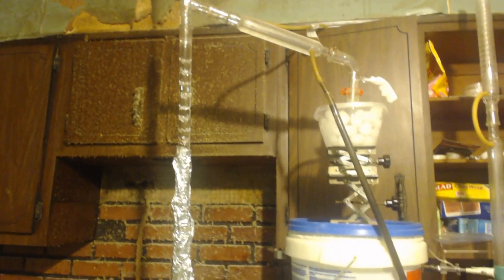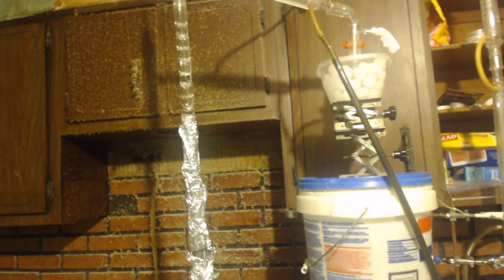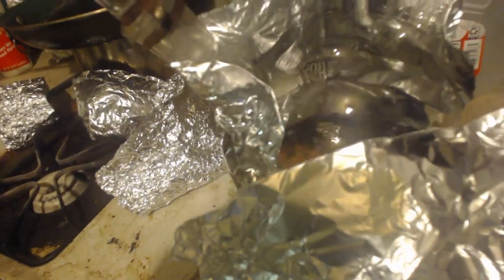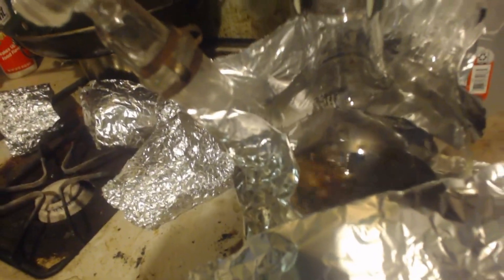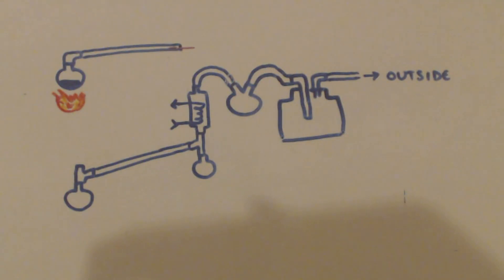I have it set up with two vigreux columns. It goes to the top and then there's more receiving glass. I'm just going to distill it over super slow — anything from 20 degrees up to 70 degrees Celsius. Then we'll distill it one last time, because right now there's about 250–300 milliliters with only a little bit of acetaldehyde in it. But once we distill it, about half will be acetaldehyde, so when we store it again it'll be easy to get nice pure acetaldehyde.